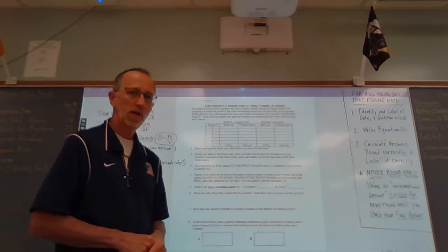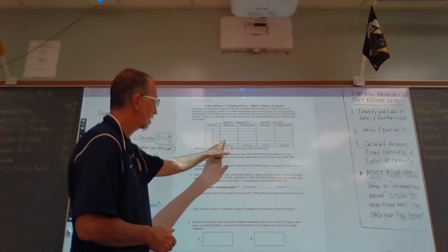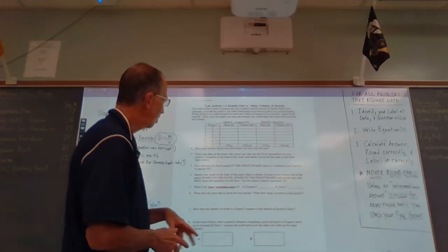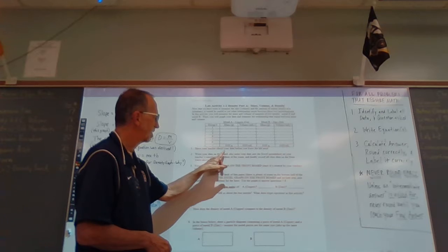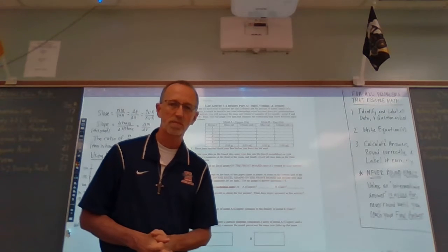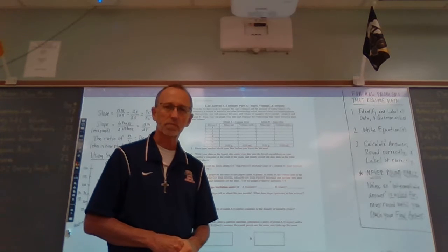So we are going to head back to the lab, and I'm going to record all 6 masses and volumes for the samples of copper and zinc. Notice we also have a 7th piece of data, which is 0, 0, for both. Think about that for a second. If we're graphing mass versus volume, is 0, 0 a valid point on the graph? And I would hope that you would say that yes, it is.